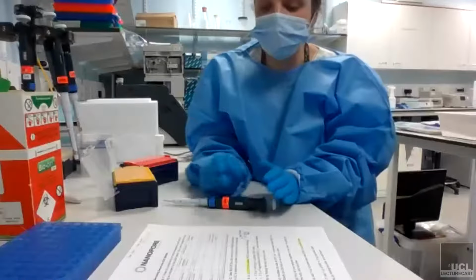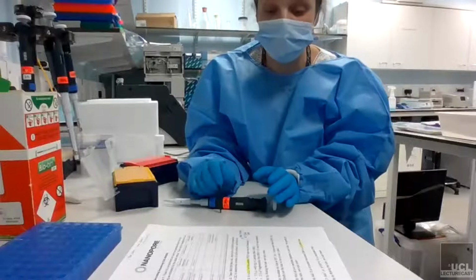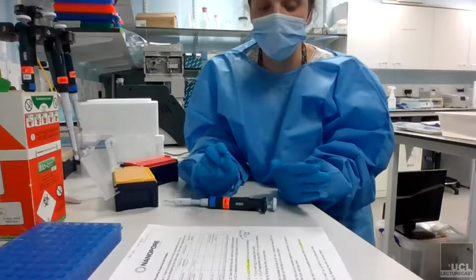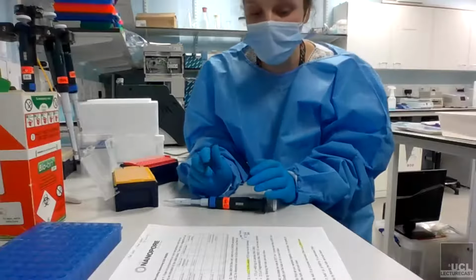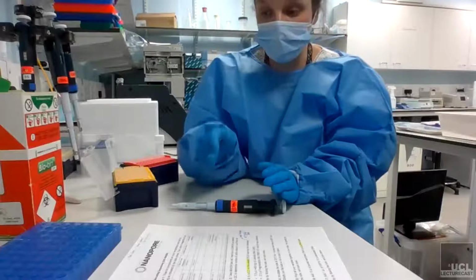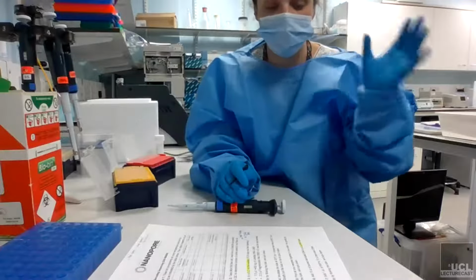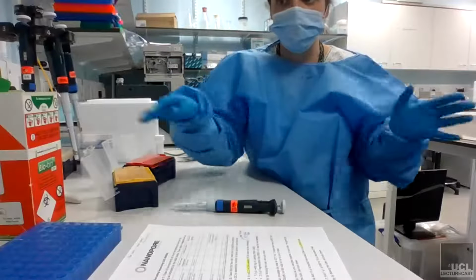I imagine this protocol probably isn't used that much for viruses because you need that amount of DNA. So you're probably more likely to use a PCR-based one or a ligation-based one. But if you go on the Nanopore community website, it will actually go through the different steps. You can put in the type of DNA or nucleic acid or organism and tell it what you want to do, and it will kind of provide you with a pipeline.